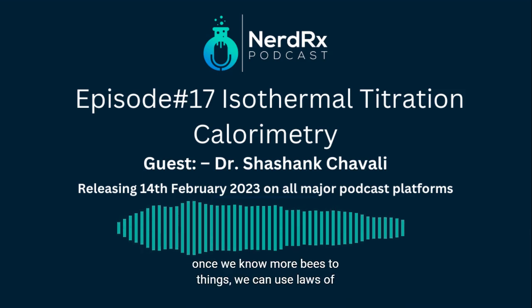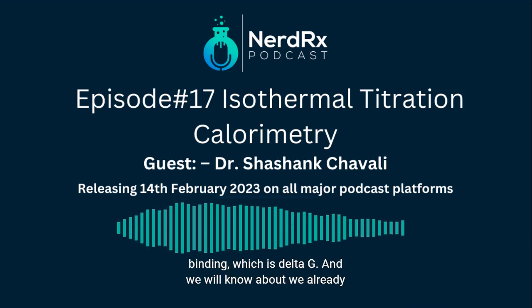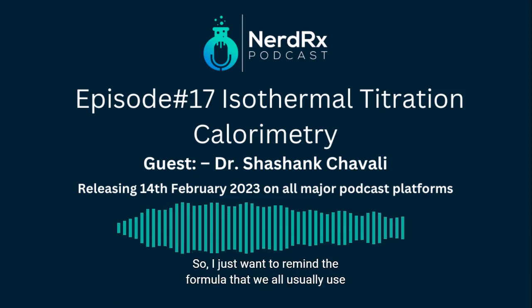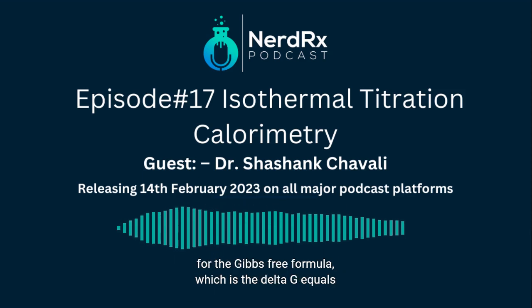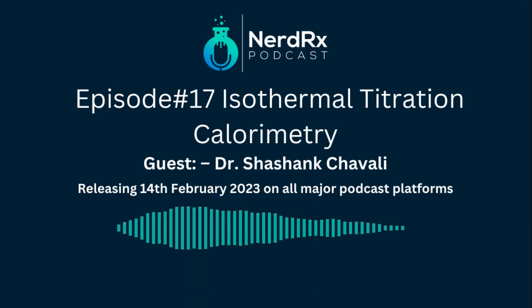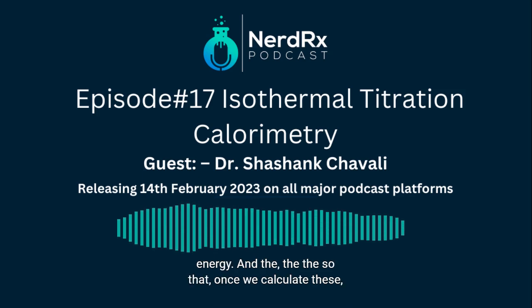So once we know these two things, we can use laws of thermodynamics to calculate the free energy of binding, which is delta G, and we already know delta H, and the only thing we need to know is T delta S. So I just want to remind the formula that we all usually use, the Gibbs free energy formula, which is delta G equals delta H minus T delta S. T delta S stands for entropy, delta H stands for enthalpy, and delta G is the Gibbs free energy.